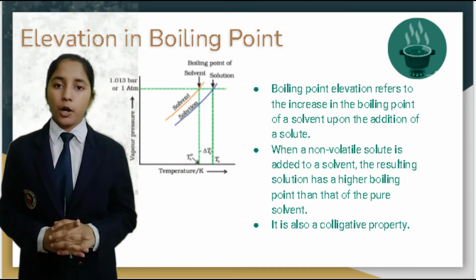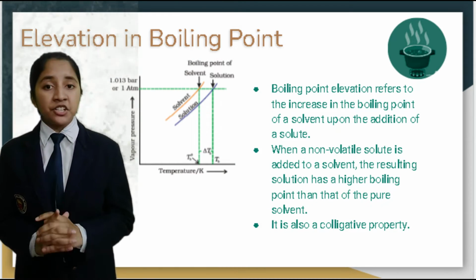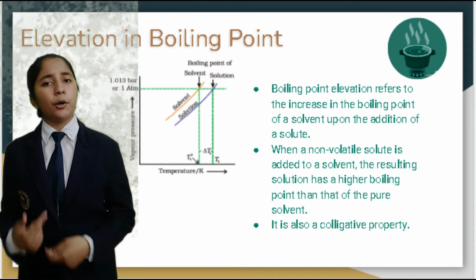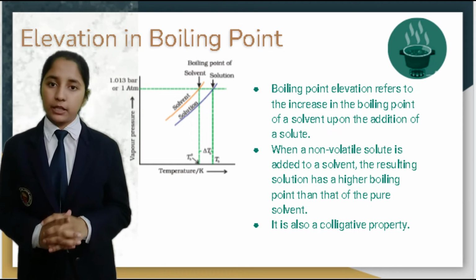Another colligative property that we are going to demonstrate through an experiment is elevation in boiling point. It basically refers to the increase in boiling point of a solvent upon the addition of a solute. Let's elaborate it through an experiment.